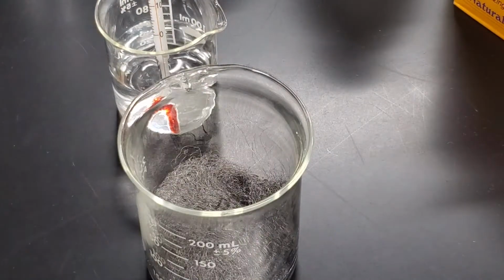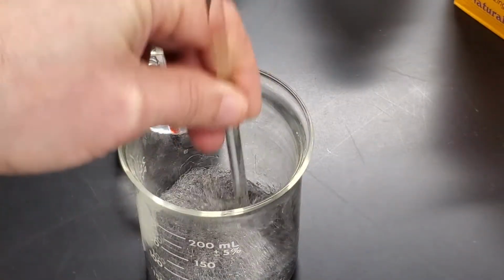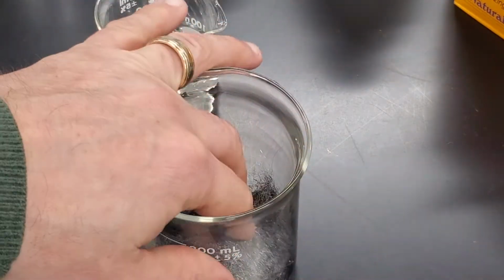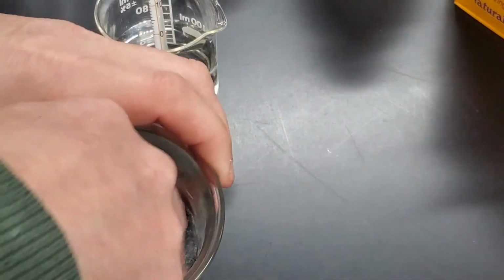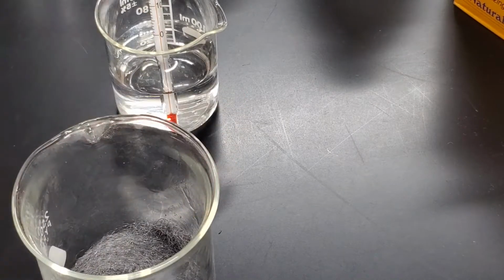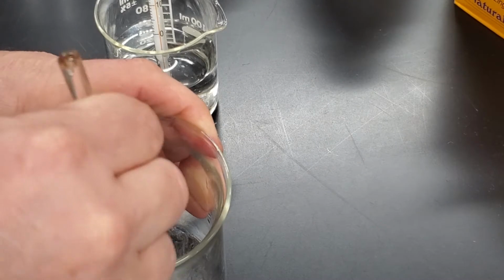Now we could use the stir stick to get this steel wool completely saturated, or you could use your hand because vinegar is not dangerous to touch, but we want to make sure that we soak up a lot of that vinegar into the steel wool. We want to give it every opportunity to soak up as much of that vinegar as we can.